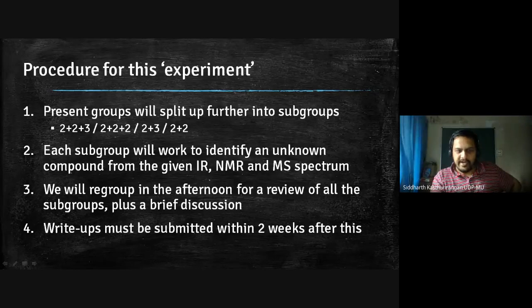ठीक है. So that at the end of the day, whatever compound is given to you, IR, NMR, and mass spectroscopy, you should be able to pinpoint most of the things in each of the spectrum, की ये spectrum में ये feature क्या है, इधर ये क्या है, इधर ये क्या, all those things. ठीक है. That is the learning aim of this particular experiment. And after we finish this discussion, then in between anytime you can catch me if you want further discussions.